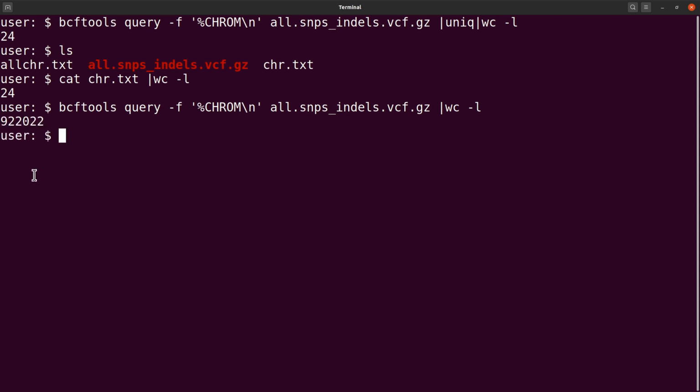This will give us the total number of variants, but this particular one can be tricky, especially when dealing with the chromosomes. So you might want to do some additional checks to confirm that the number you have is actually what is expected. So just try, and sometimes do some additional validations, or you can look at applying other tools to see if you get the same answer or similar results. So take note of that.